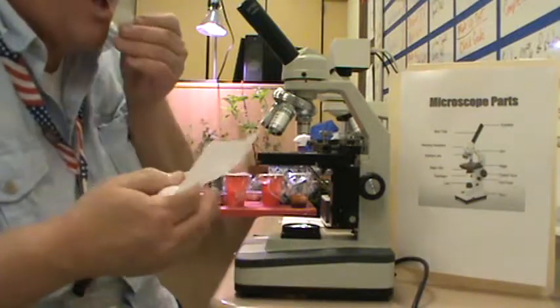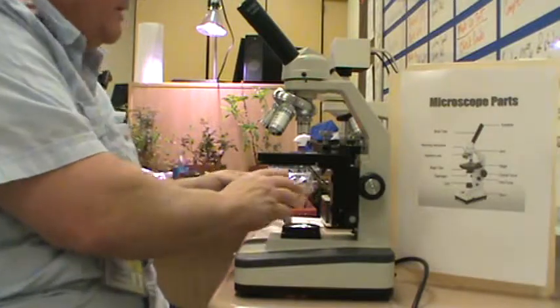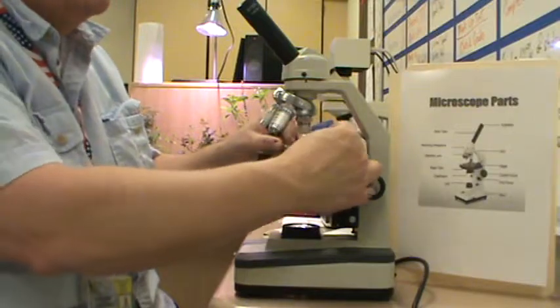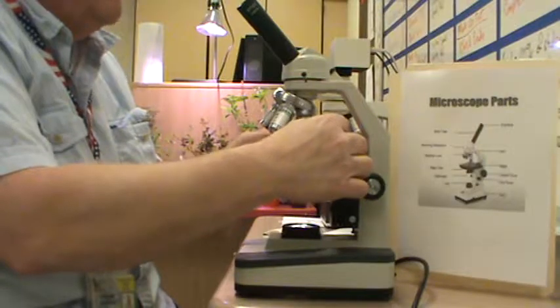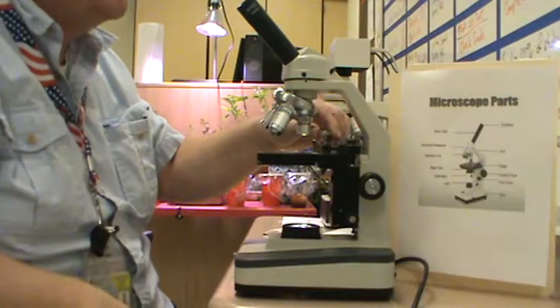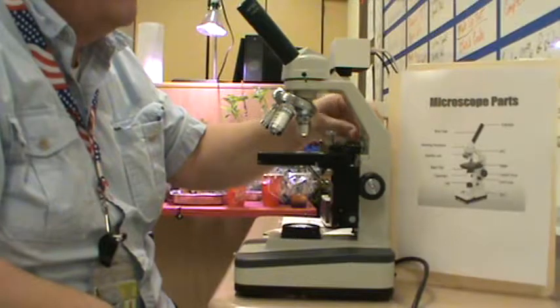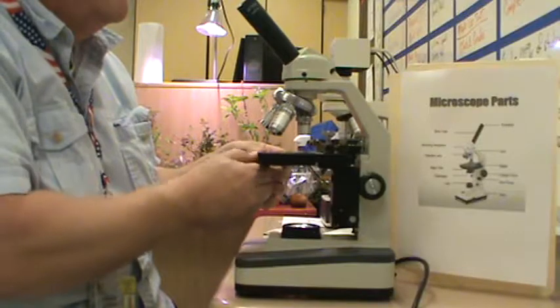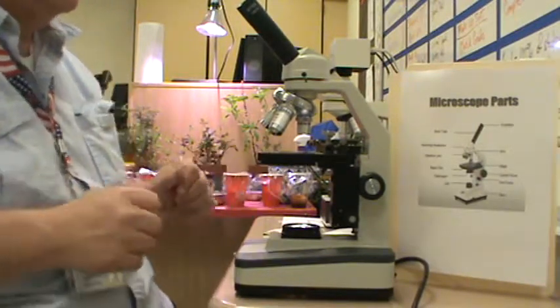Let me try that again. In this case, this happens to be an old prepared slide of lung tissue. I move the clip out of the way, set the slide up in the holder in the proper position, allow the clip to come back. I then am going to use my adjustments so that I can position this sample over the aperture. I'm going to adjust the diaphragm to where I have a medium amount of light coming in to start with.